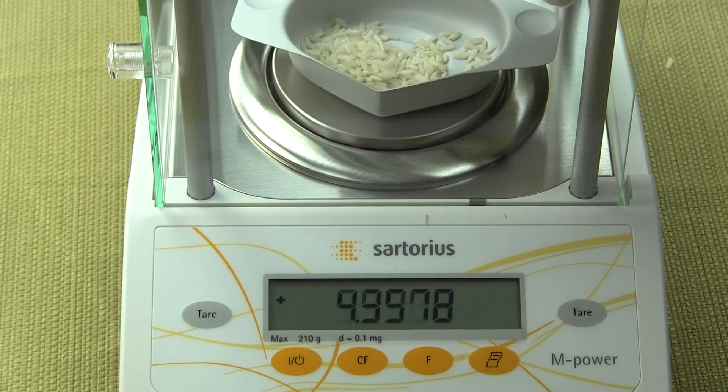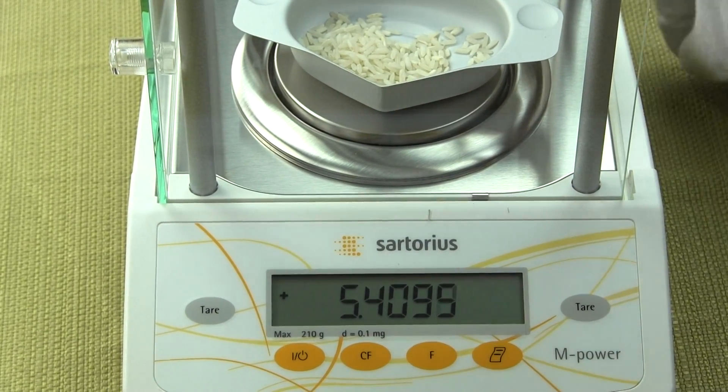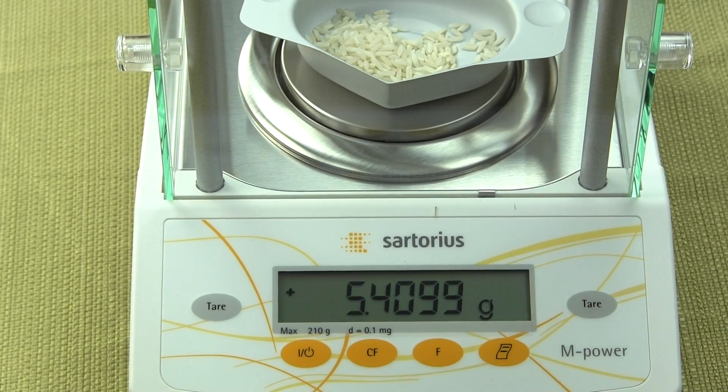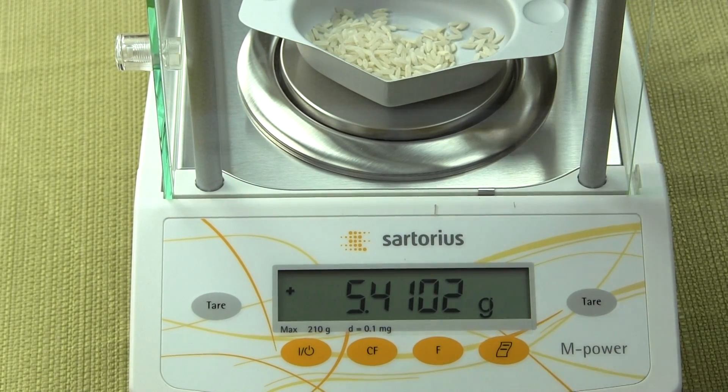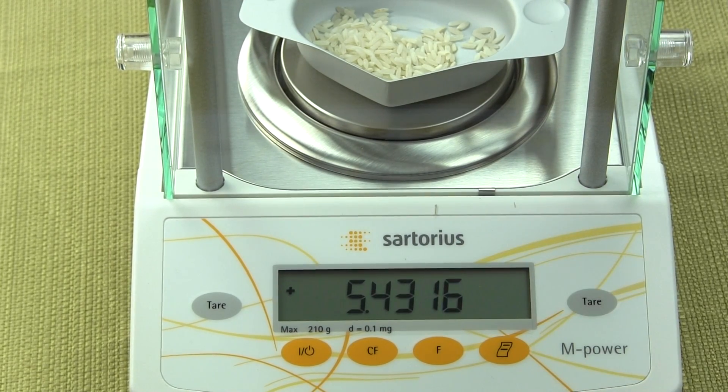The balance is very quick compared to competitive brands. And again, this is their economy version, their low end analytical balance. You can see the balance altogether. The door should be closed to get a reading, but the results are great and fast. And if I drop one grain of rice, it picks it up no problem whatsoever.